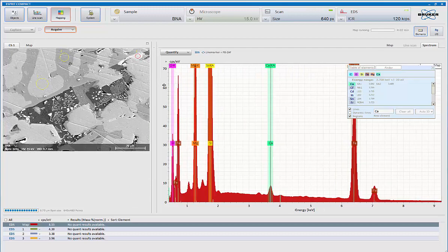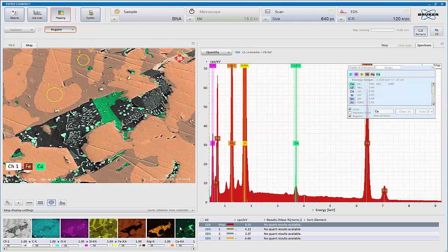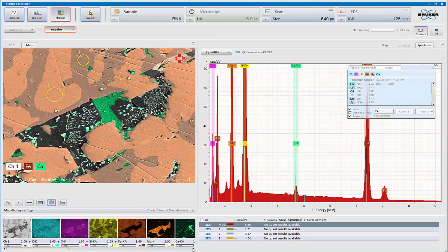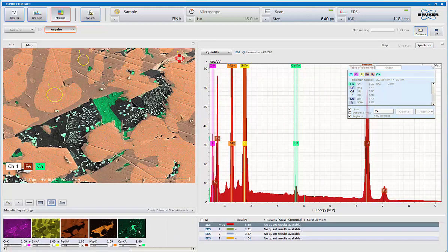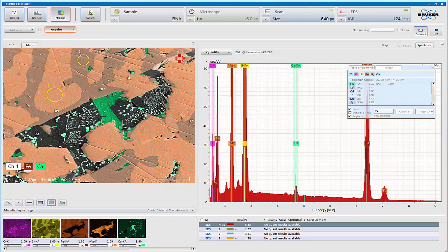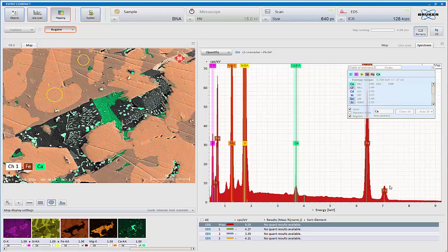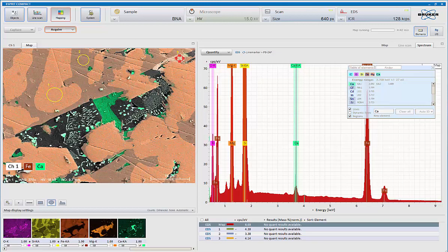So what I'm going to do is I'm going to make the image larger, click on map, and down here, here is my calcium map overlaid onto my image. So this is the overall spectrum map, all the x-rays within this field of view.